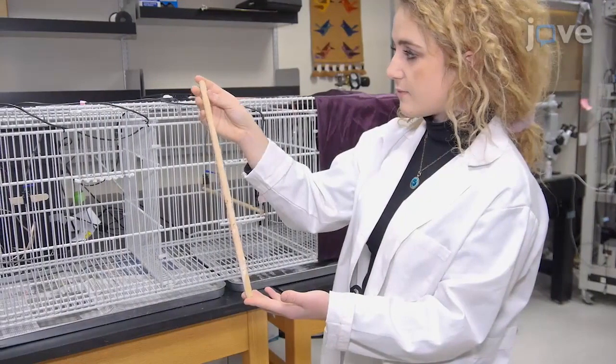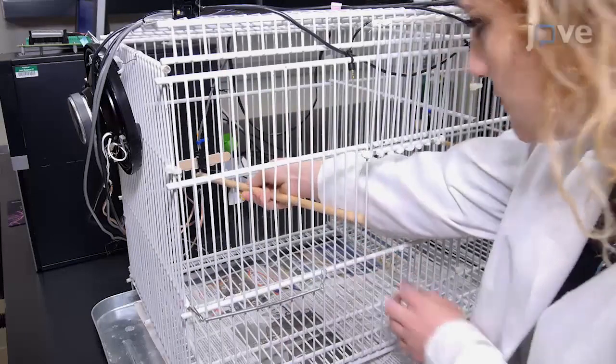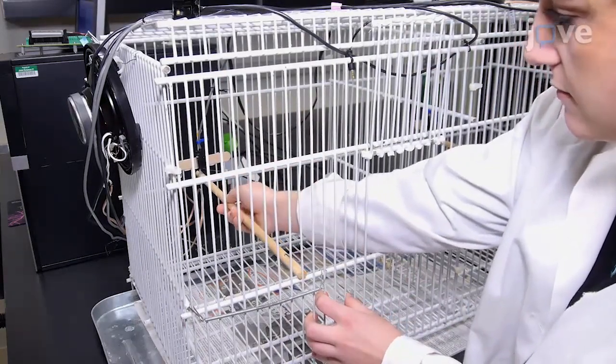In each chamber, place any kind of perch that is suitable for the type of bird being tested, 11 inches from the center of the cage and 6 inches from the bottom of the cage, spanning the width of the cage.